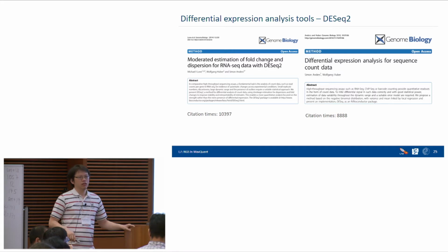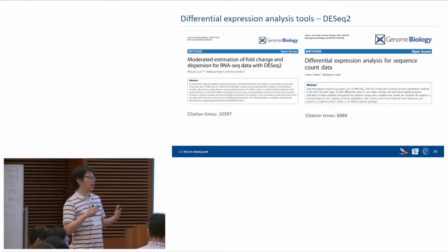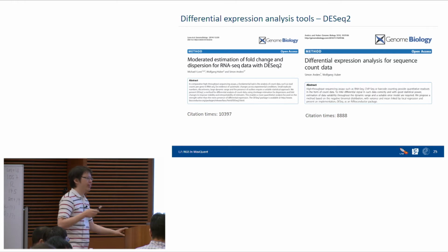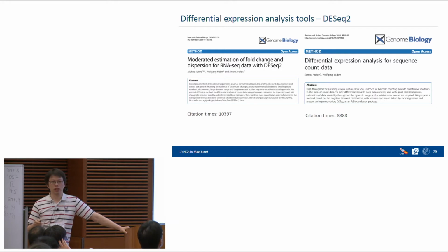Okay. Now we have shown you the data that we can easily compare. But actually the most common task in data analysis is differential expression analysis, no matter which omics data you use. If you have experience using Perseus for differential expression analysis, you will notice there are not many options that you can choose. Basically, we integrate the student t-test. You can compare one sample, two samples, or multiple samples.